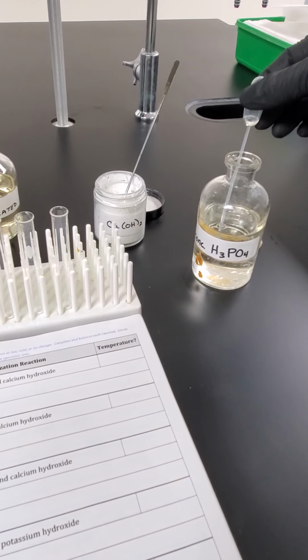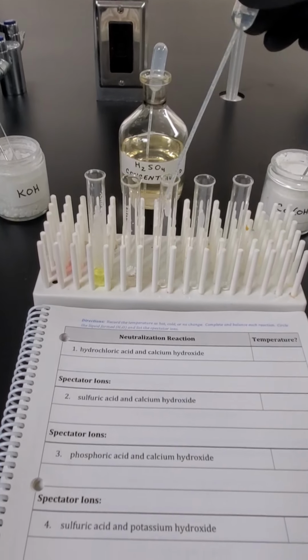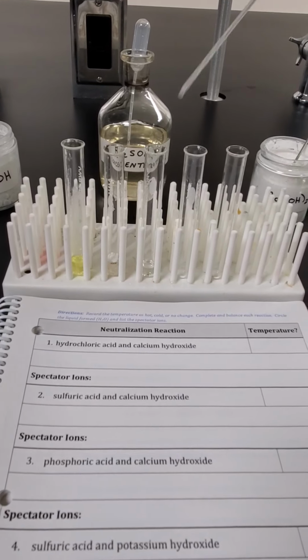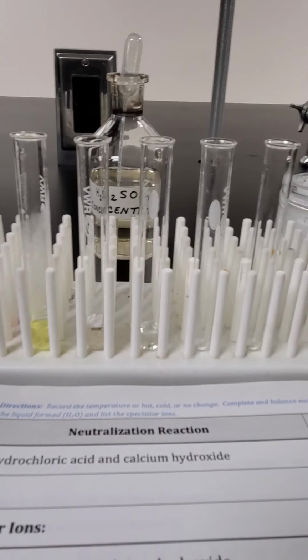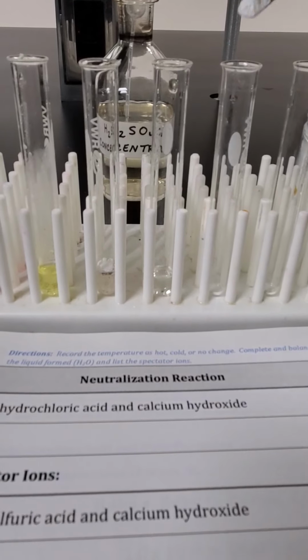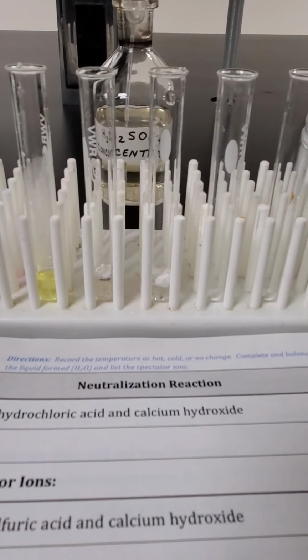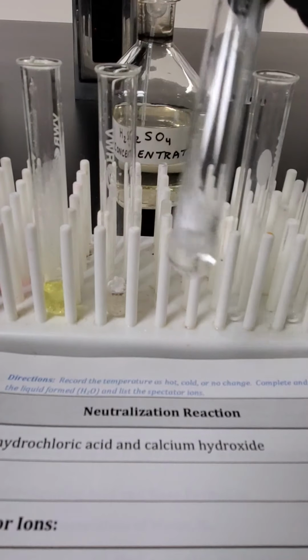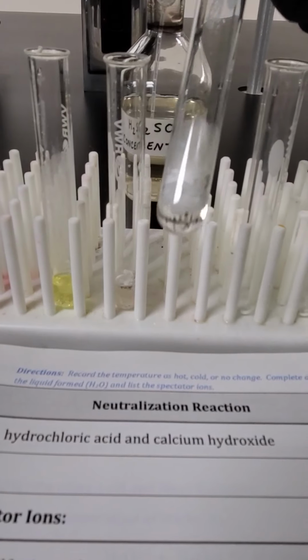Also very syrupy. It's like the ring of death over here with all these strong acids. And calcium hydroxide one more time. Nothing too exciting there, although it is getting warm.